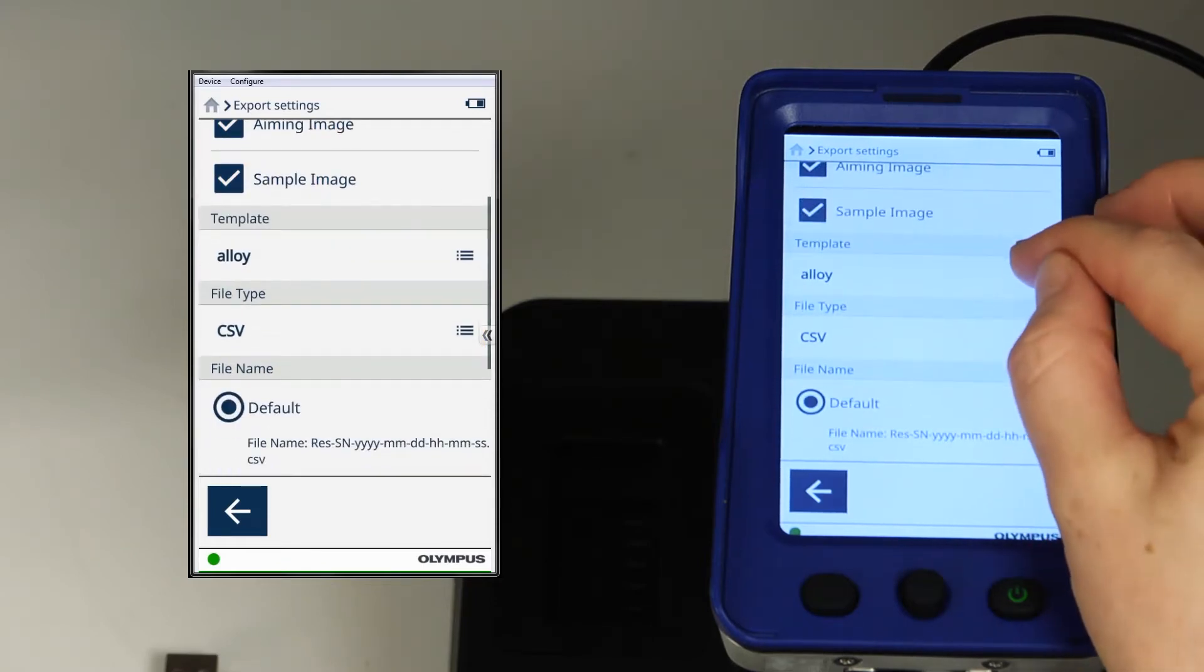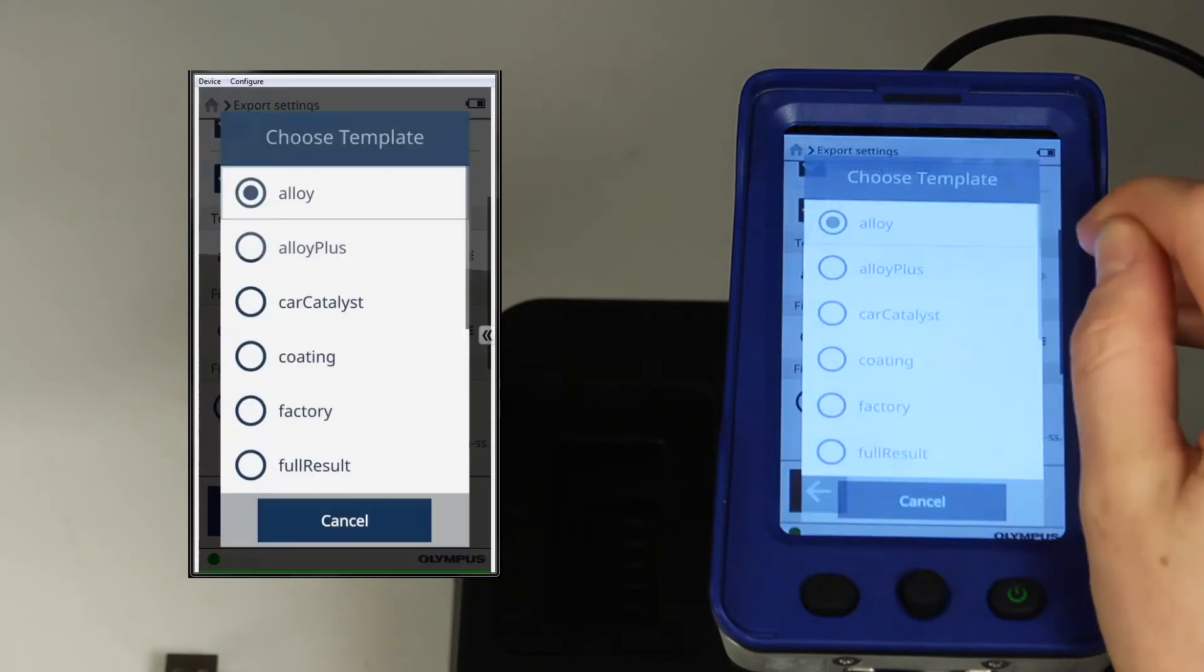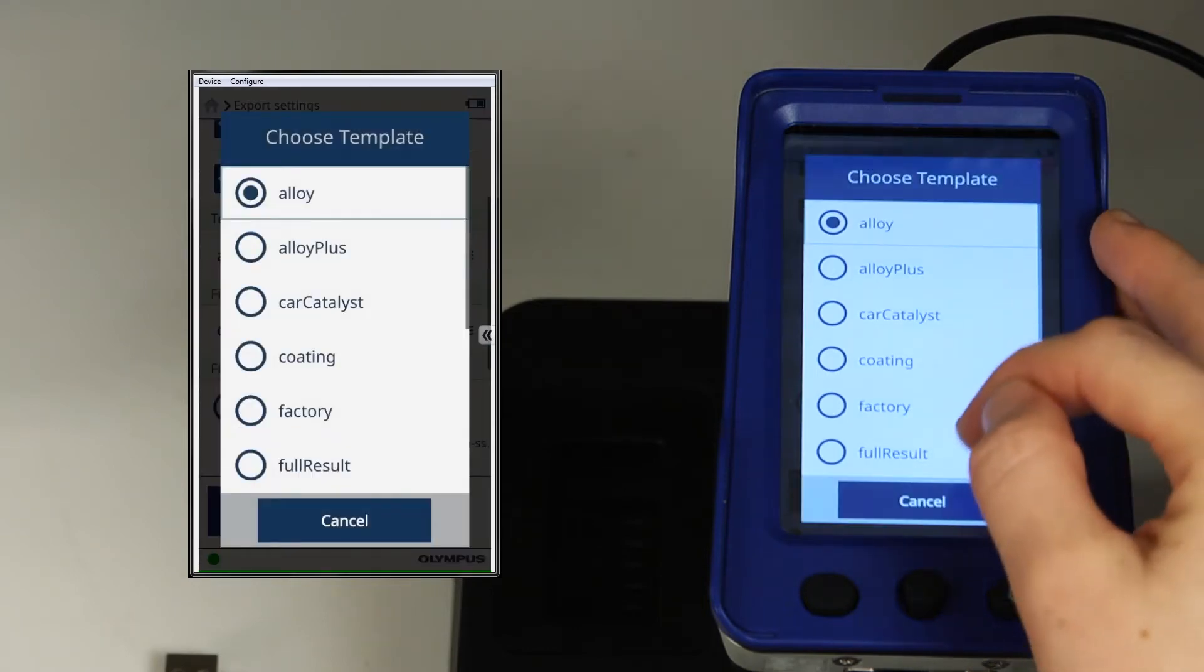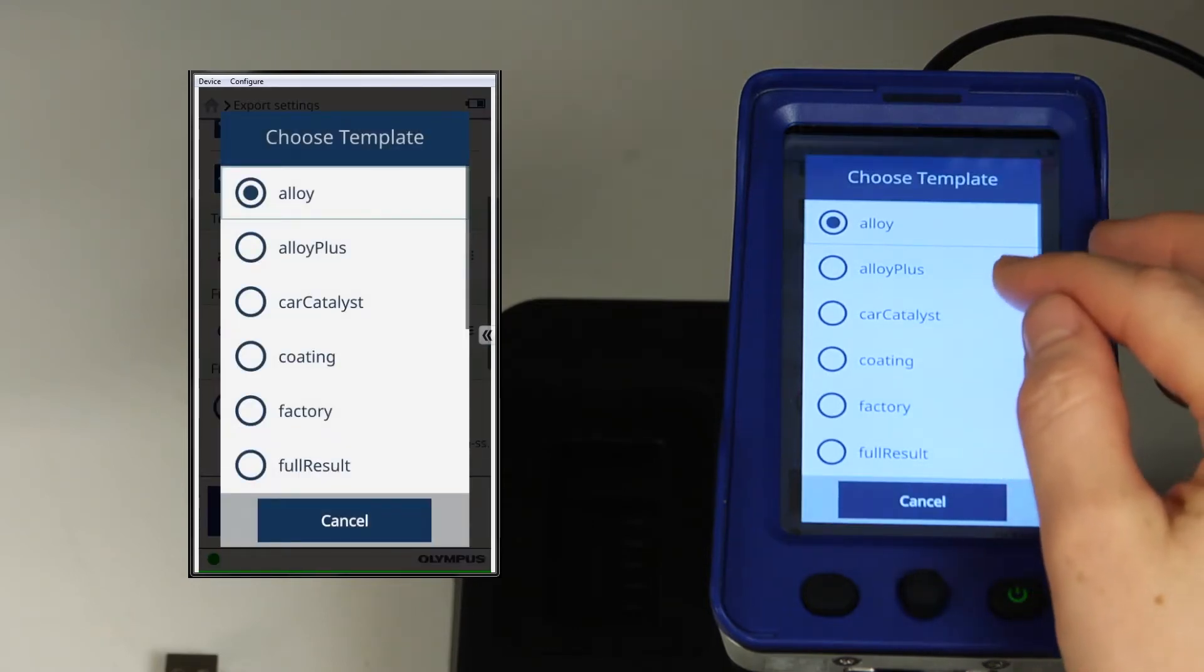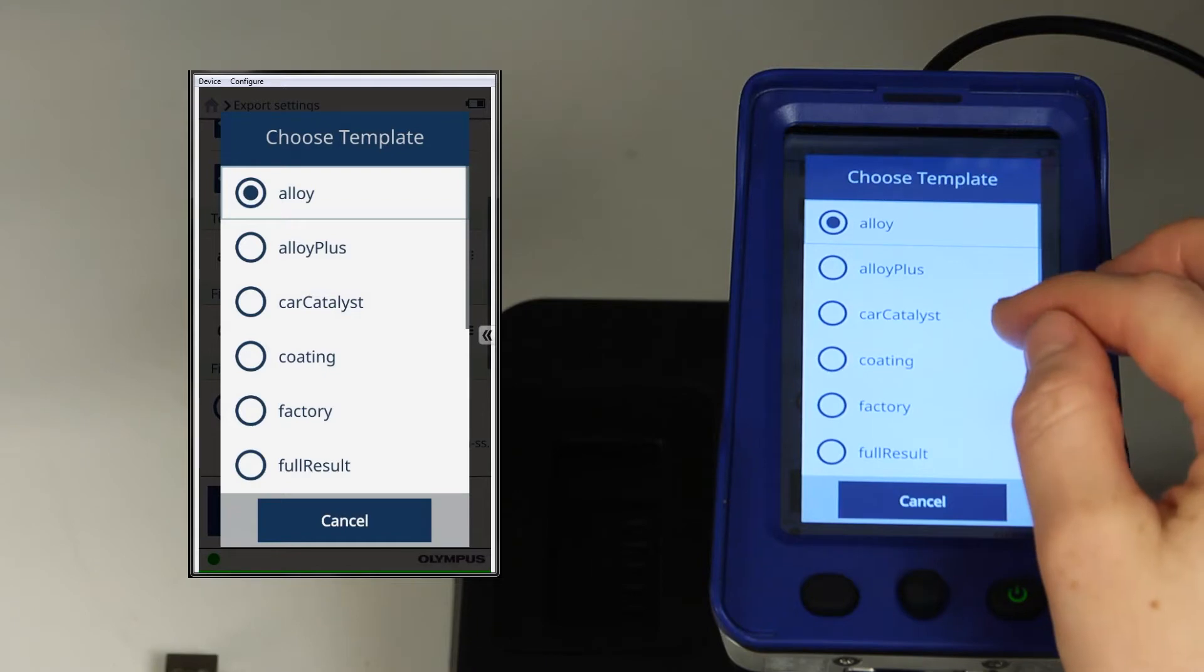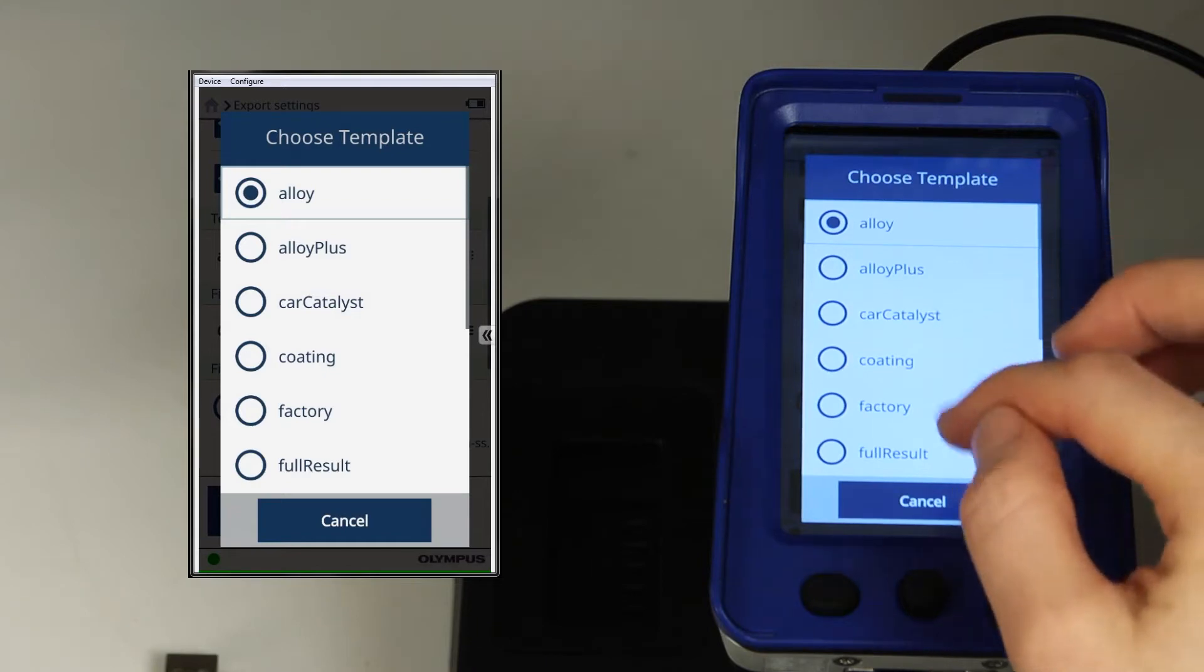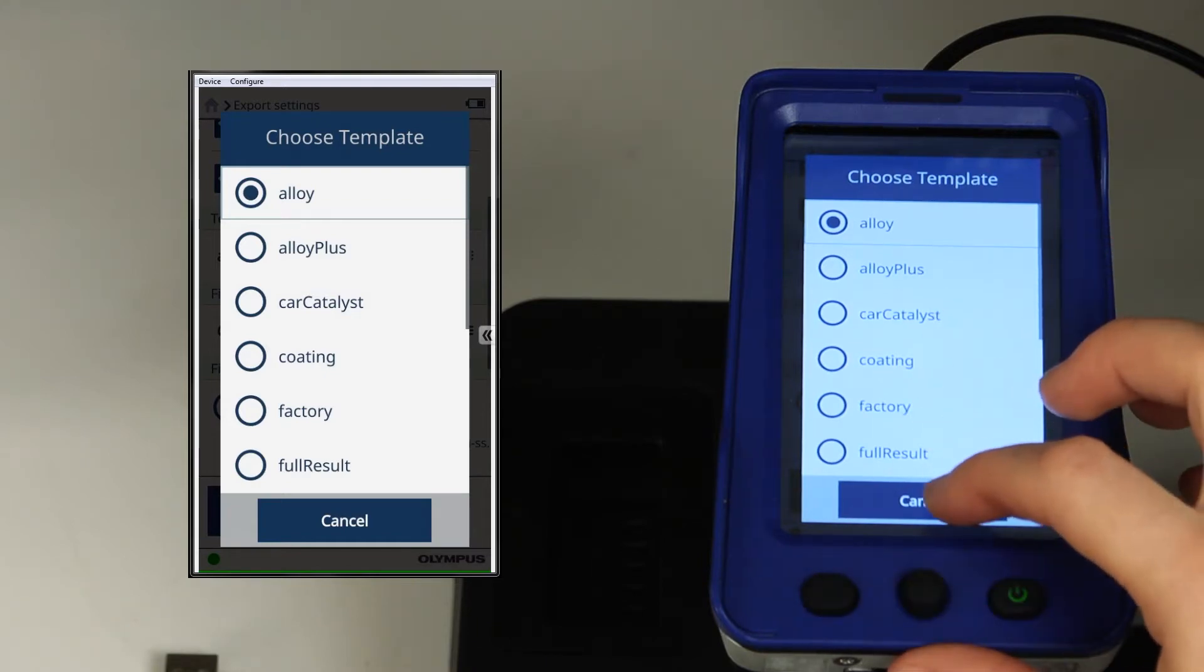For the template, you have different options corresponding to the analysis mode. Since I'm doing tests in alloy mode, I'll leave the alloy template enabled.